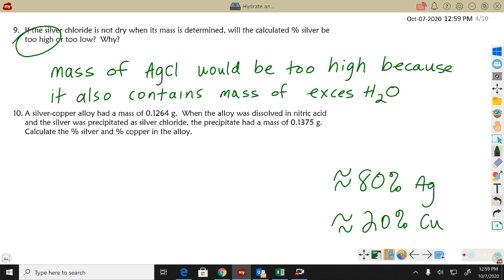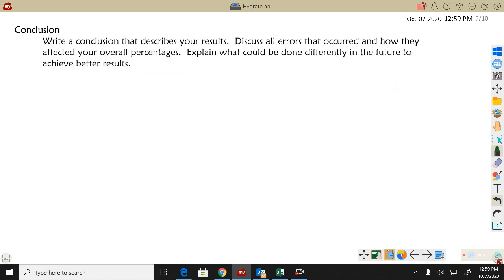I'm sure that you're on the right track. You're above average intelligence. Finally, then, we're going to write a paragraph conclusion, describing our results, discussing our errors, how they affected our percent, and what could be done differently in the future.